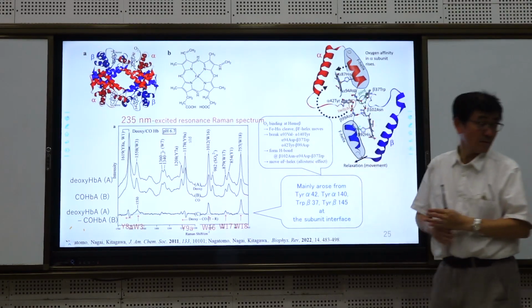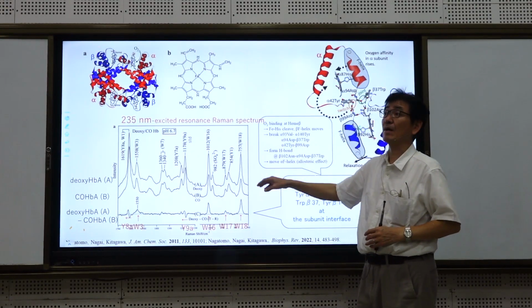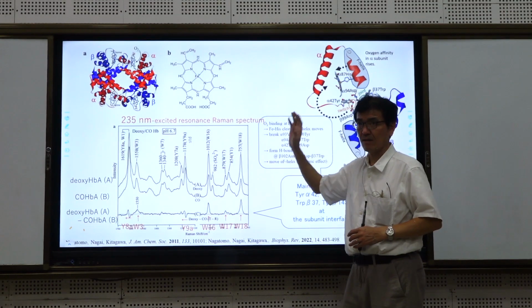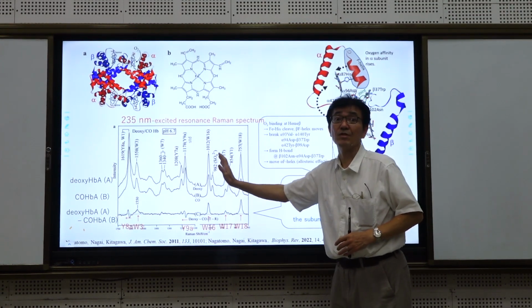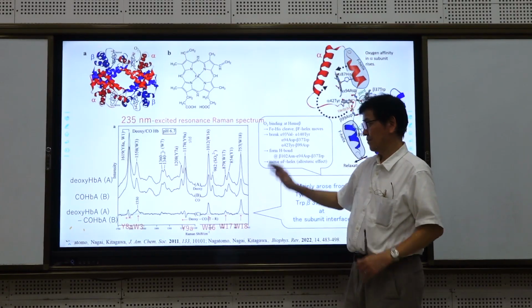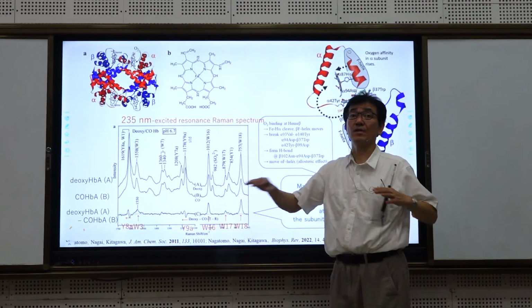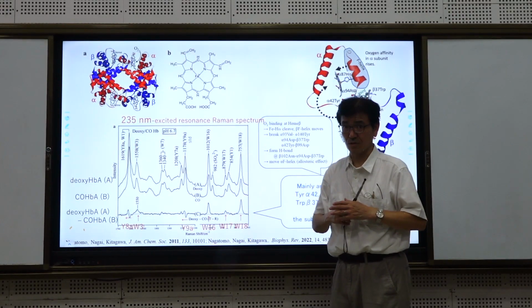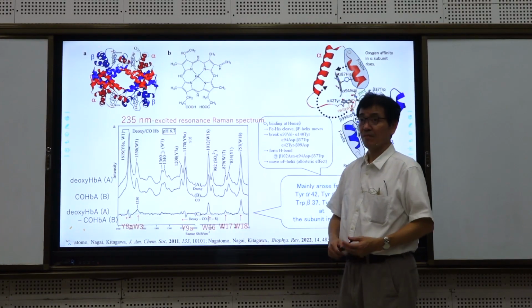So, there are many bands in the Raman spectrum, and some bands should be useful for your purpose. Today, I cannot cover all the examples of all the molecules in the limited time, or in a lifetime.